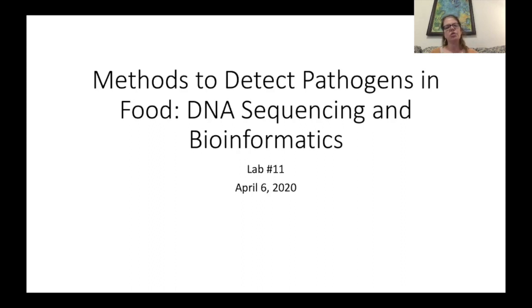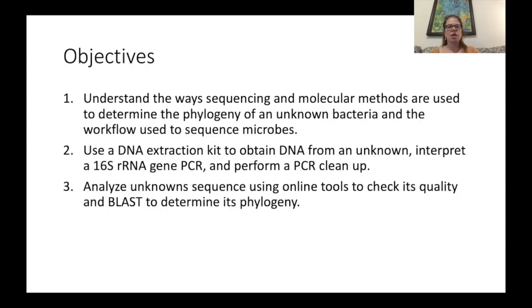DNA sequencing is as it sounds. It's the sequencing of DNA. Bioinformatics is the science or the analytical methods by which we analyze those sequences. There are three major objectives to this lab. The first is to understand the way sequencing and molecular methods are actually used to determine phylogeny.